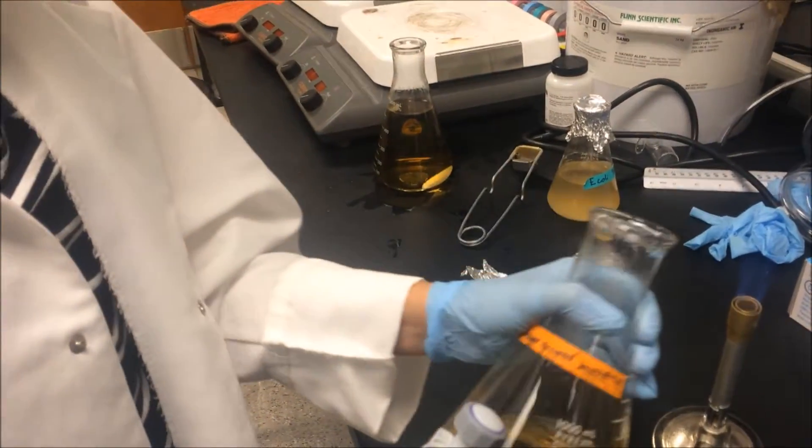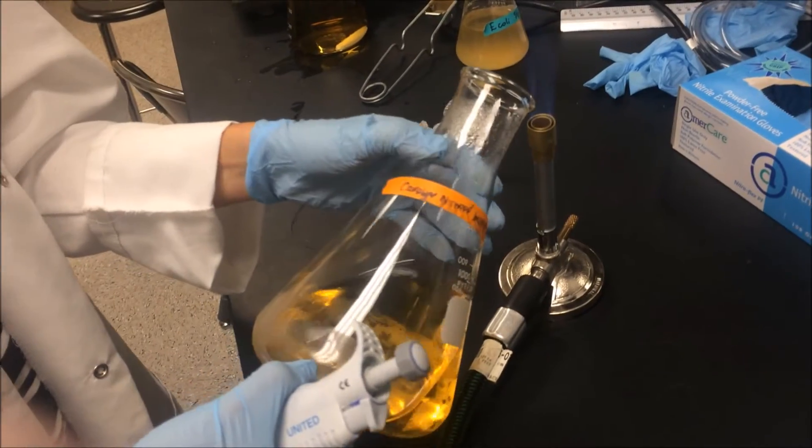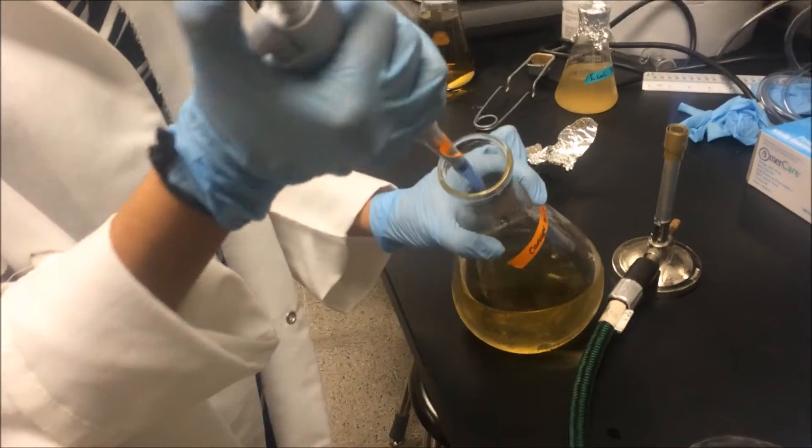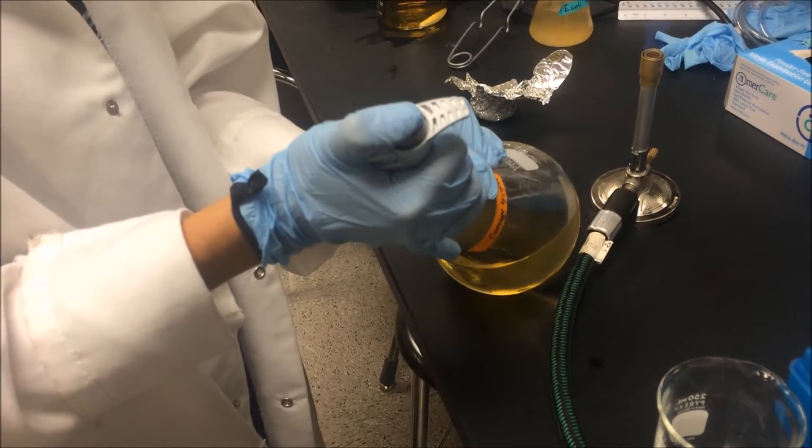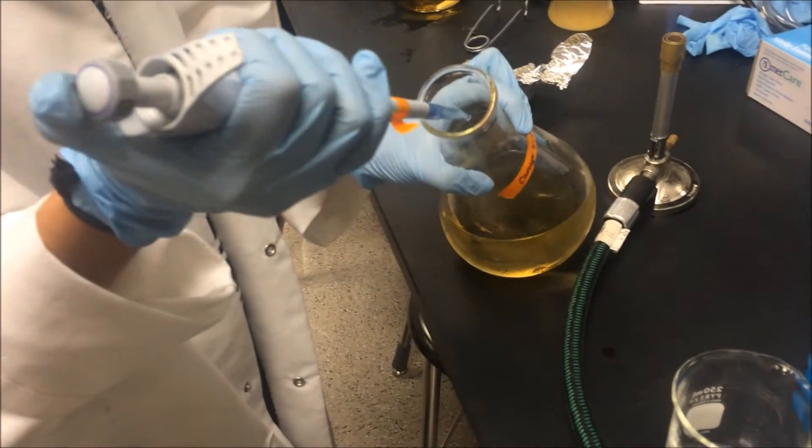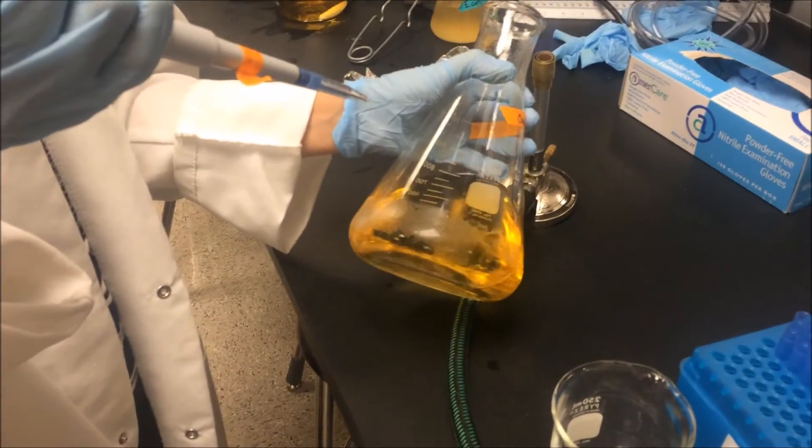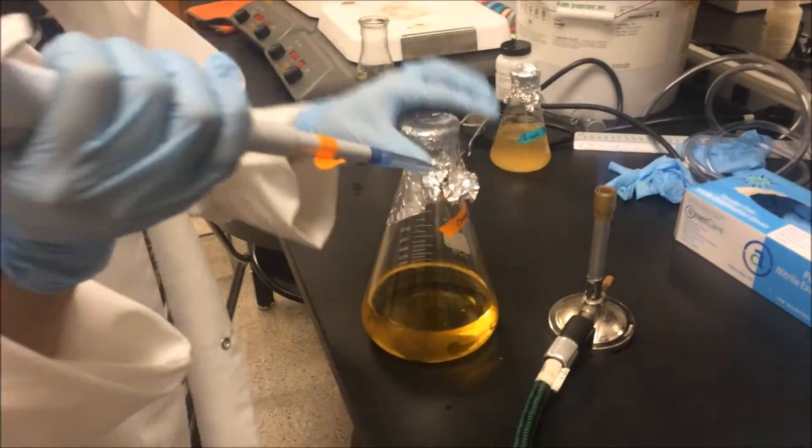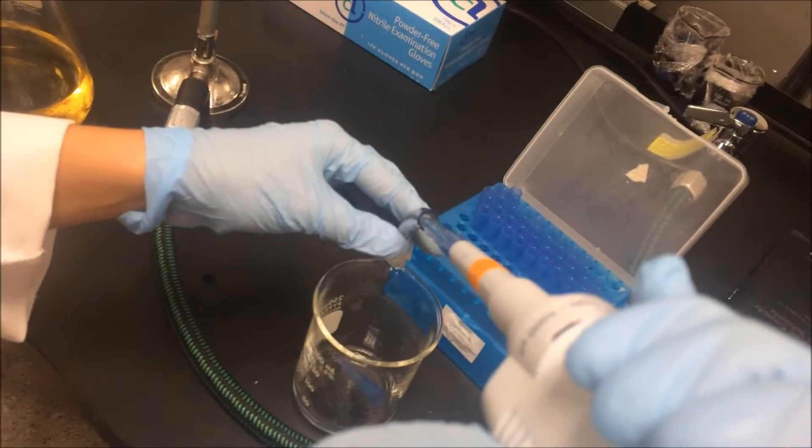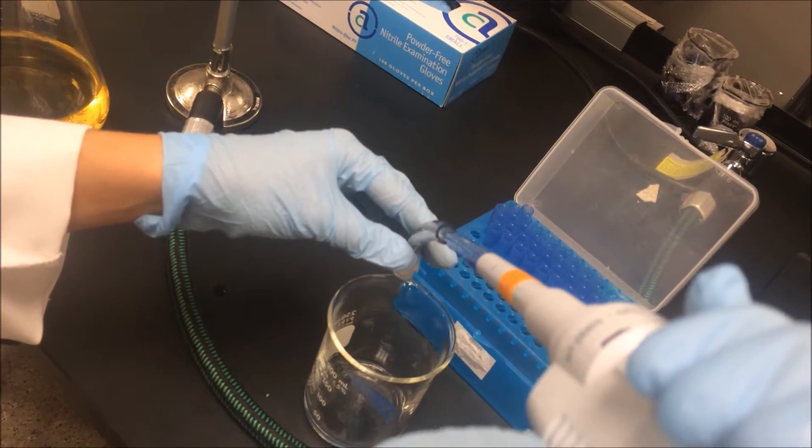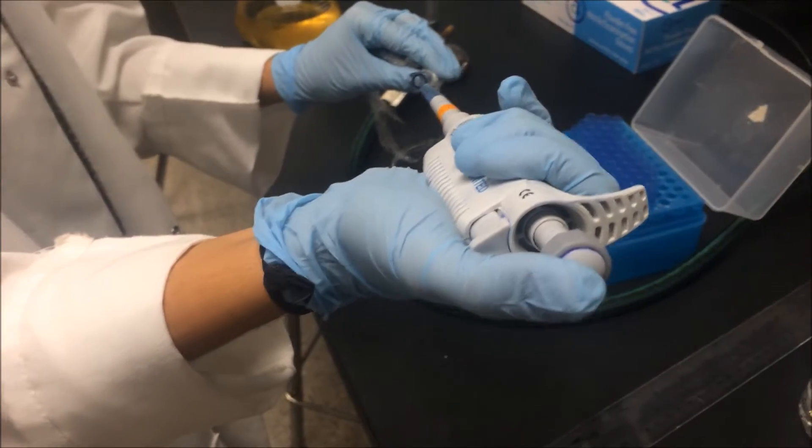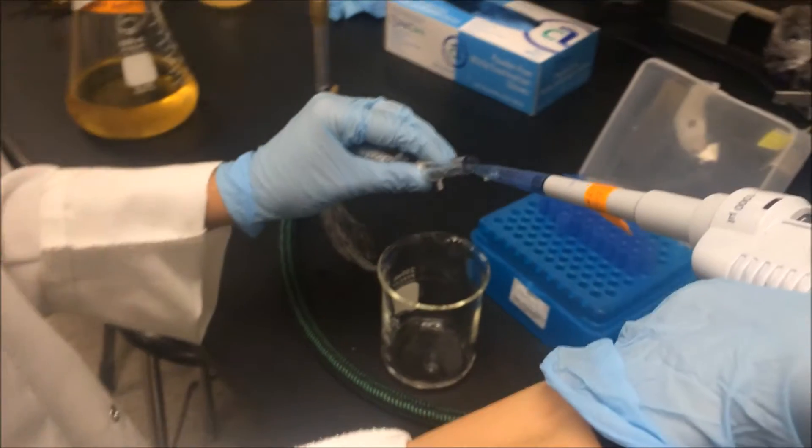Get nutrient broth and flame lid to kill all bacteria. Now get 1,000 microliters of nutrient broth. Flame the lid again to kill bacteria before putting the cap back on. Put the nutrient broth in the tube. Now discard pipet tips. Repeat the last step so you have 2,000 microliters of broth in the tube.